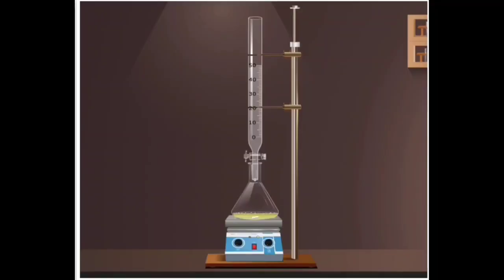To the same conical flask solution, 2 to 3 drops of methyl orange indicator are added, that is, without pouring out the conical flask solution. Now the solution will turn yellow. This is titrated against standard hydrochloric acid from A milliliters till B milliliters is reached, that is, till the endpoint orange color is reached. The titration is repeated for the concordant values.